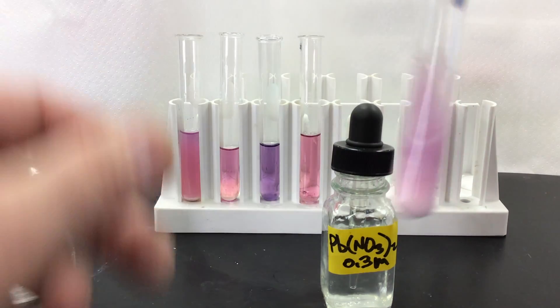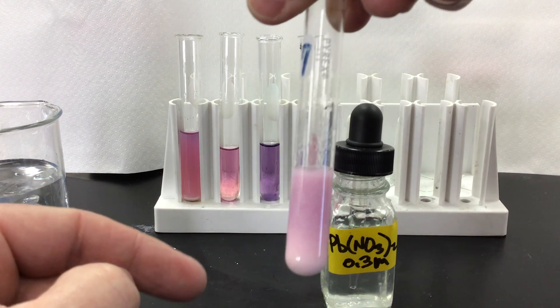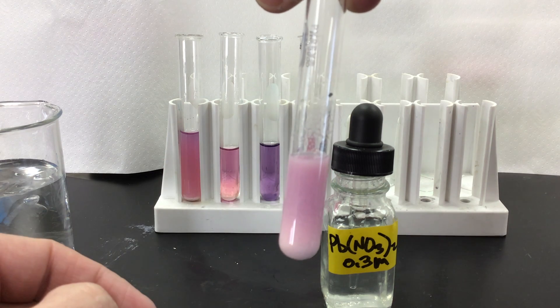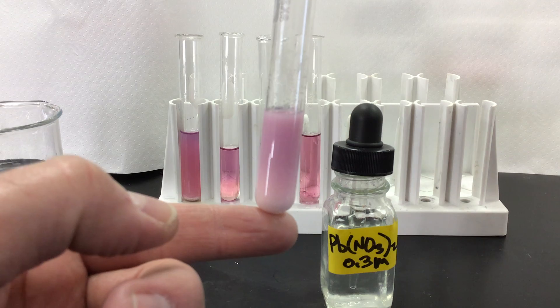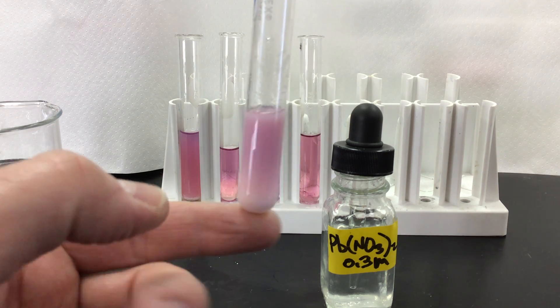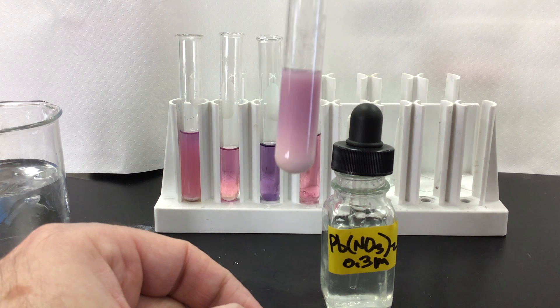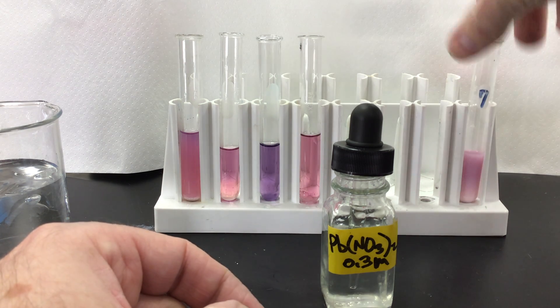So turns cloudy white pretty quickly here, but then definitely turning kind of a pink as well. Again, the white is going to be our precipitate that's forming. If we let this settle out, you'll definitely see more white on the bottom, and then definitely turning pink as well. Good piece of information there.